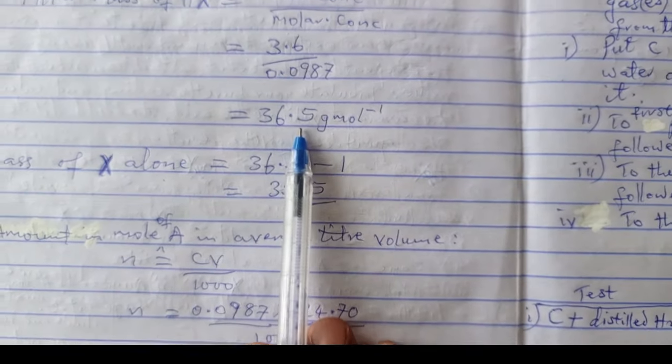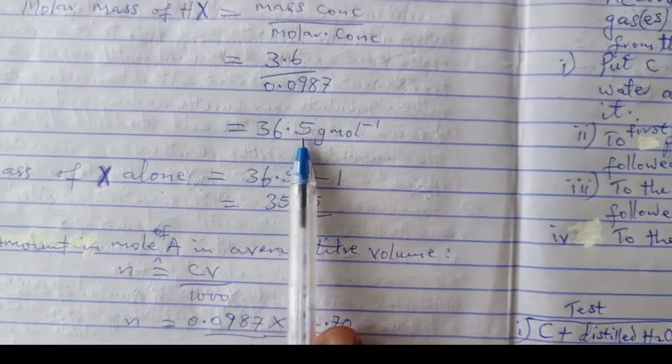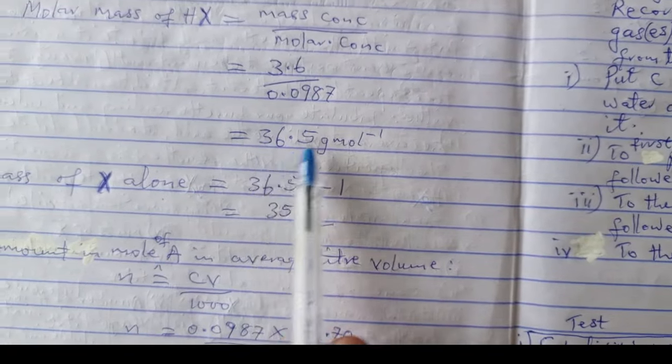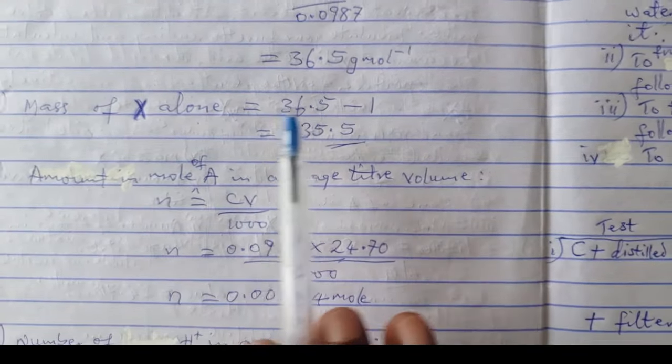Okay, so you have this as the molar mass of the acid. With this molar mass of the acid, you can predict what substance has this as molar mass. It is HCl.